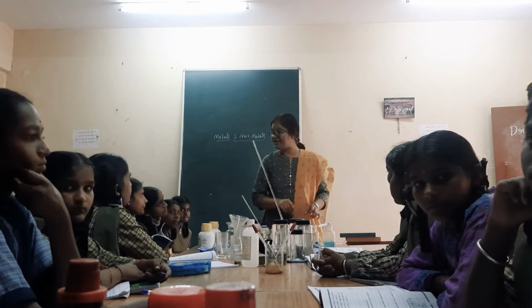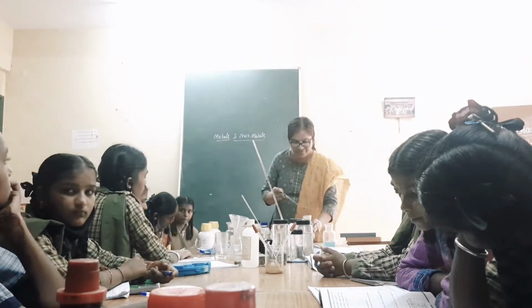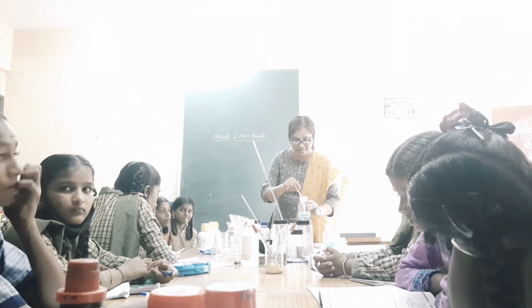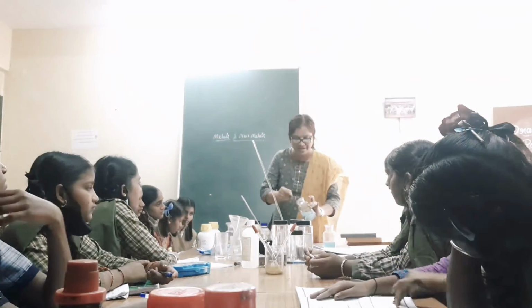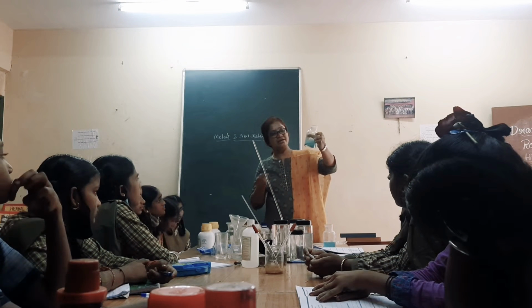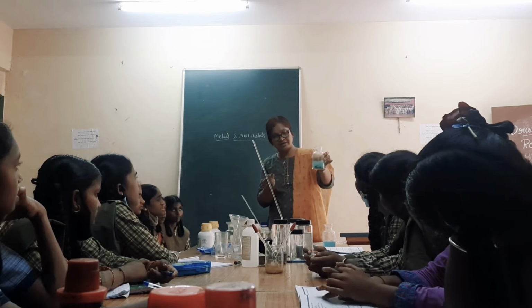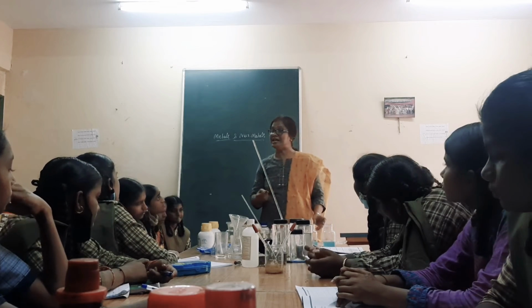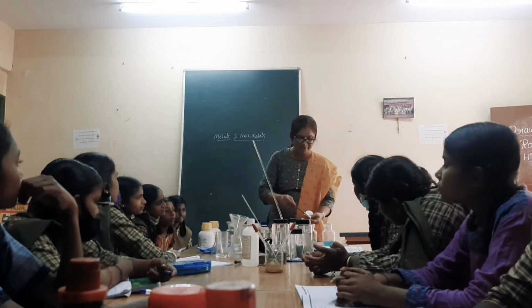Okay. The second one. What is the solution taken in the second beaker? Copper sulfate, with the nail placed in copper sulfate. You can see a little bit of brownish color surrounding it, right? That is the iron displacing the copper. Again I will wipe it.